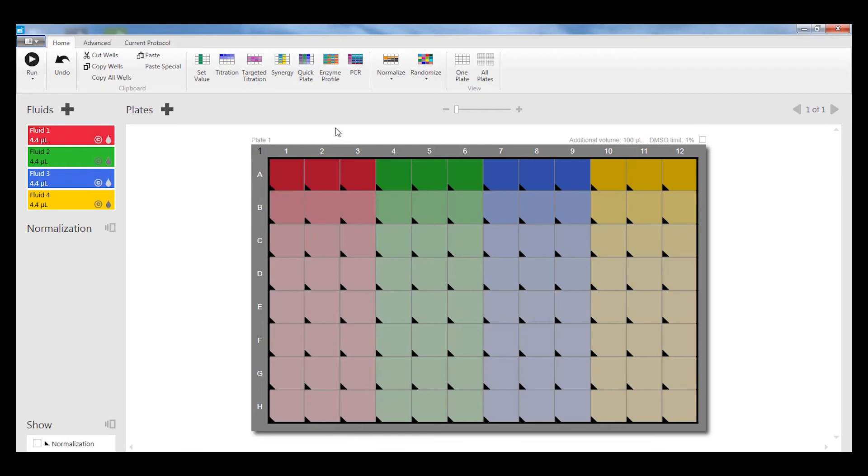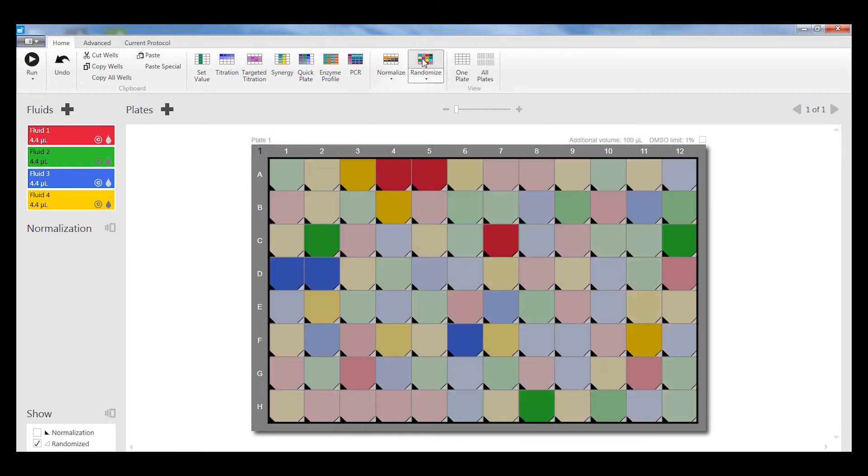I can simply click on the randomized function to distribute the wells, the concentrations across the plate, and not correlate the concentration of the fluid with the location on the plate.